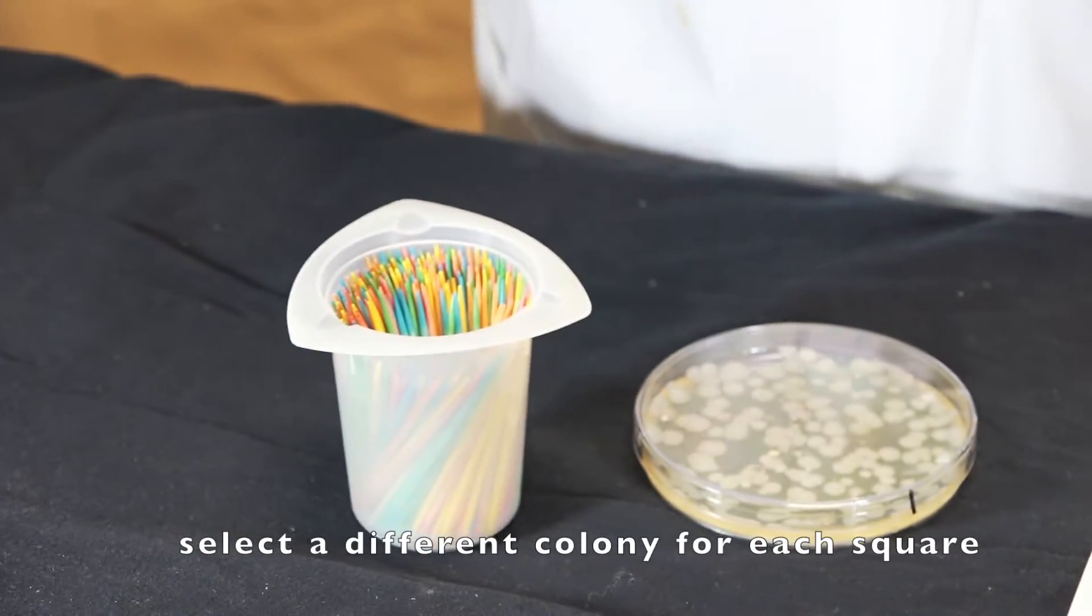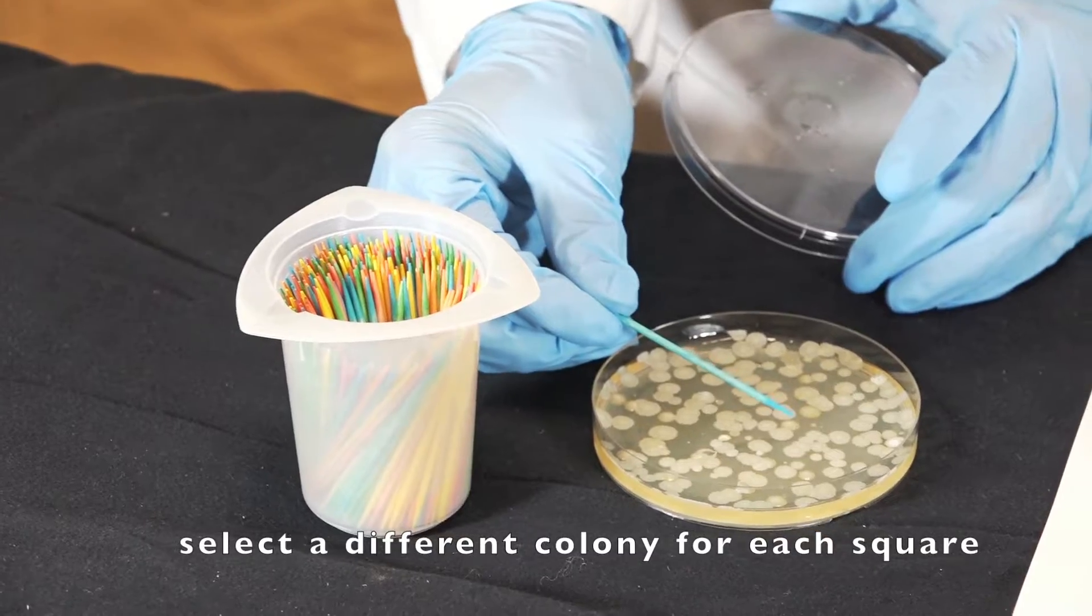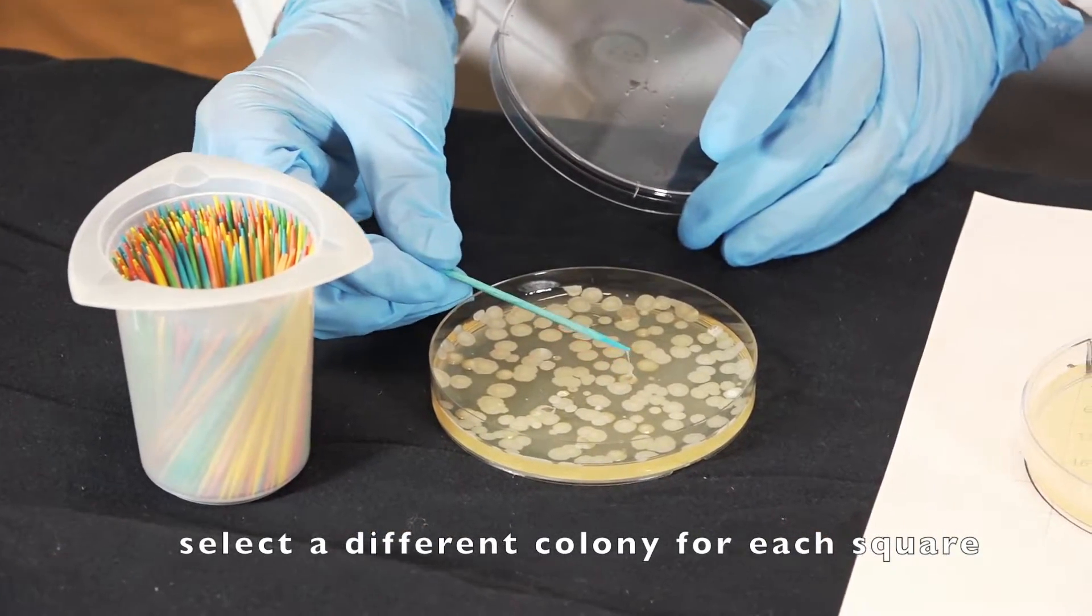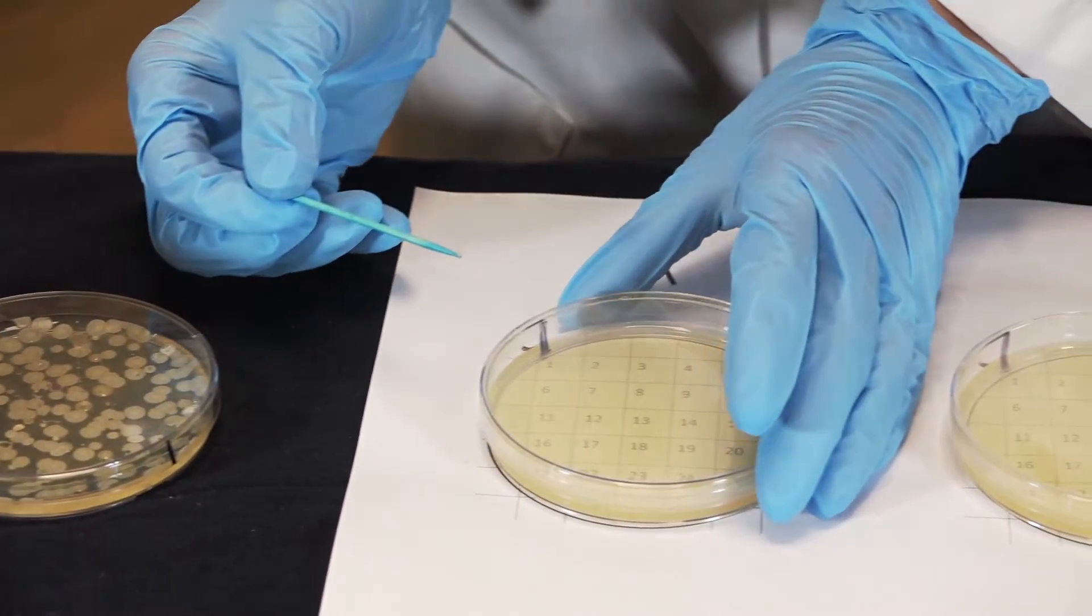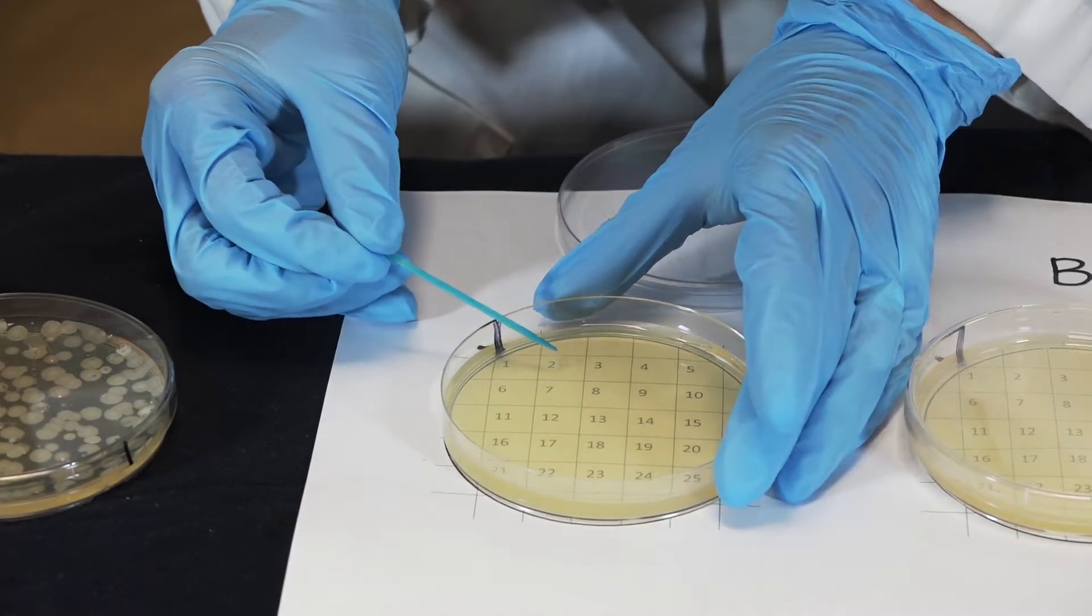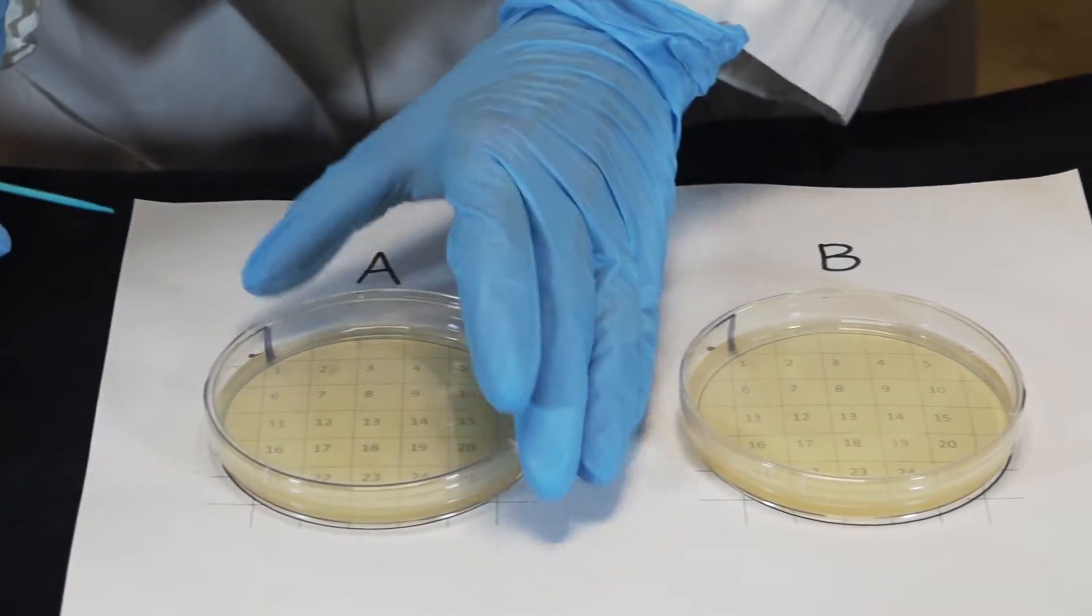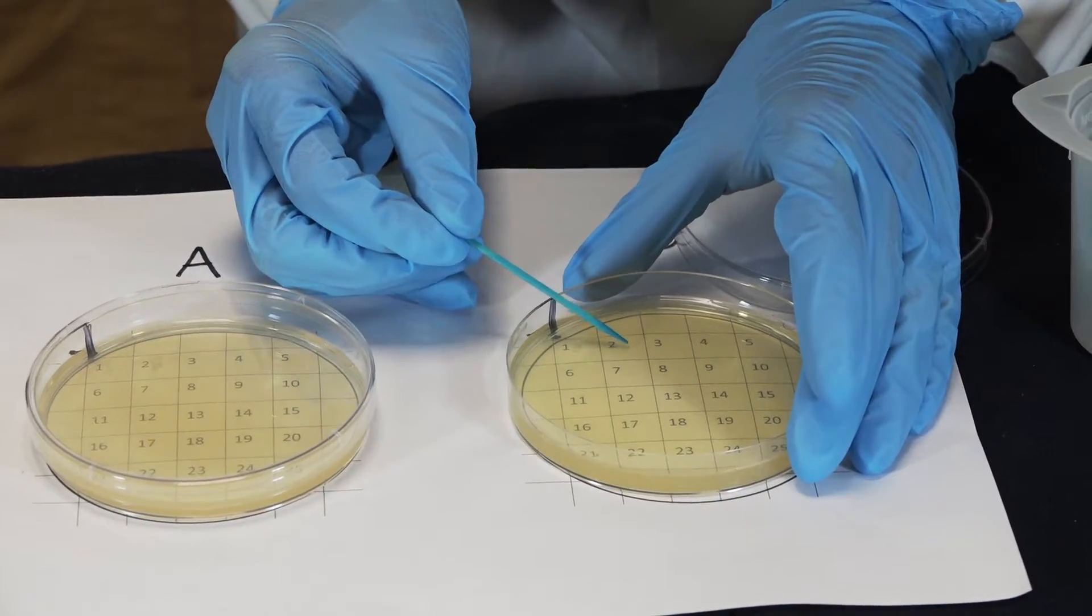I'll get a new sterile toothpick and pick another colony from this plate. And inoculate square two on plate A and square two on plate B.